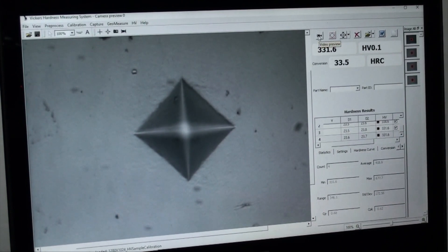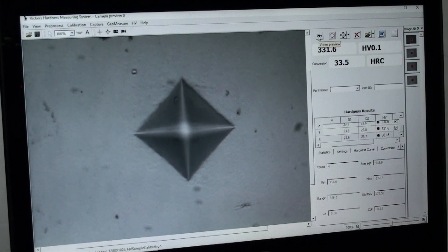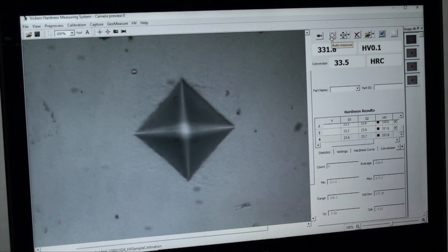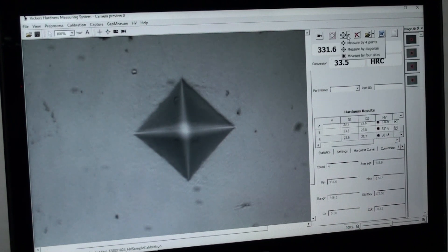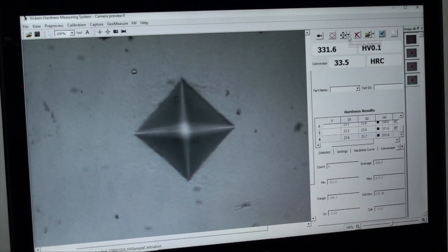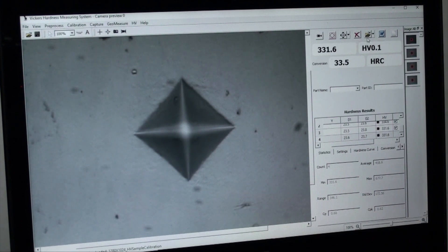On the top right, we have the refresh button, auto measure, measure by diagonals and points, remove the last reading, select data file locations, and generate report.